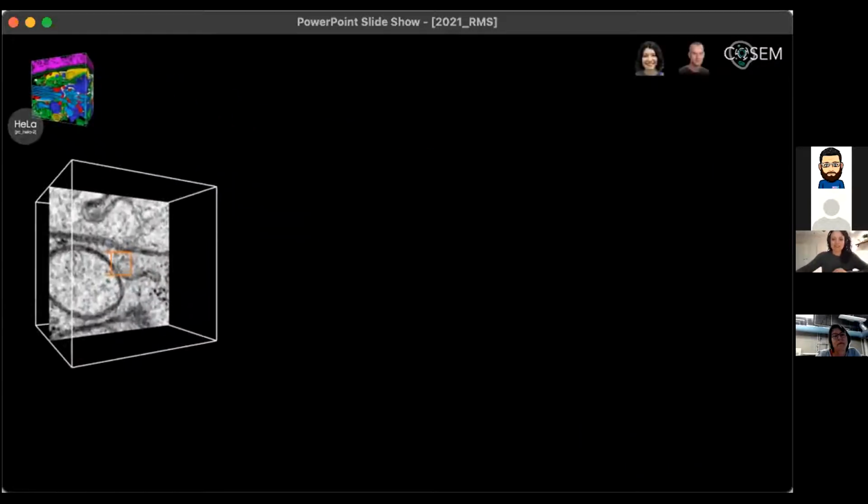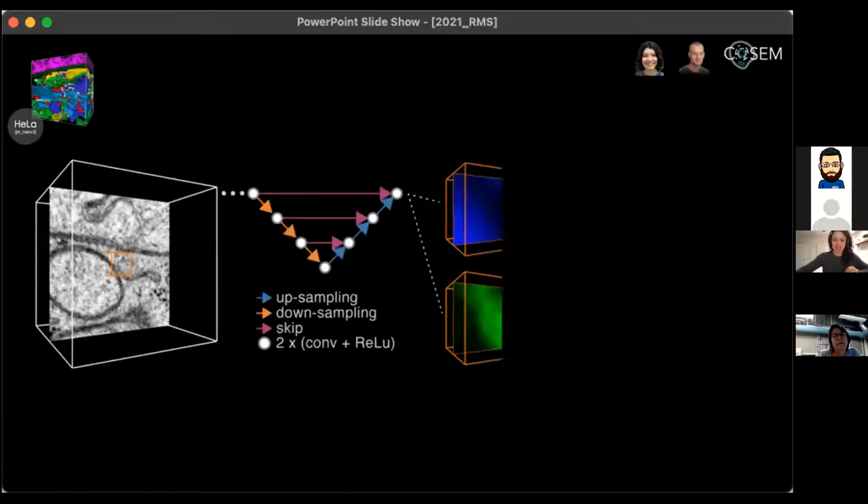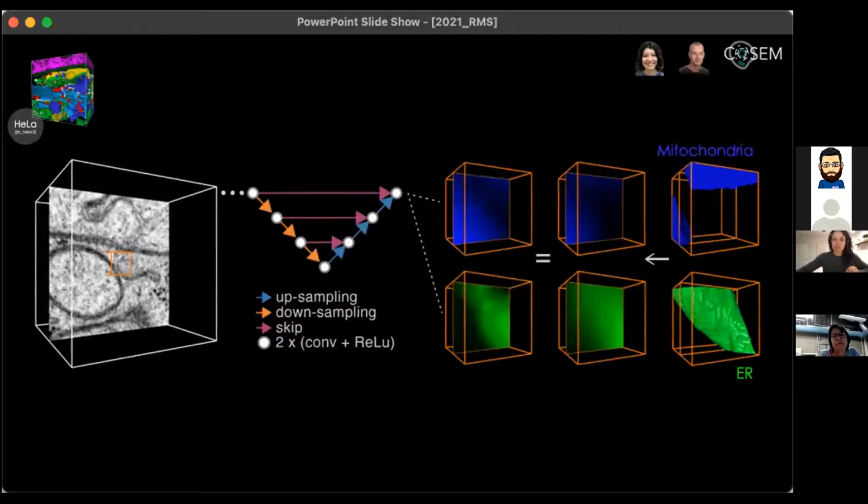All right, so what do I mean by training? So the training data I just showed to you is then used to train machine learning classifiers. We use a mostly standard setup with a 3D UNet architecture, as you can see here in the middle. And this is trained by repeatedly feeding in blocks of raw data that produces some output for the innermost part of the block, so the orange part here, which is then compared to what it should look like according to the ground truth annotations, and the parameters of the network are adjusted accordingly. So this process is repeated hundreds of thousands of times in our case.